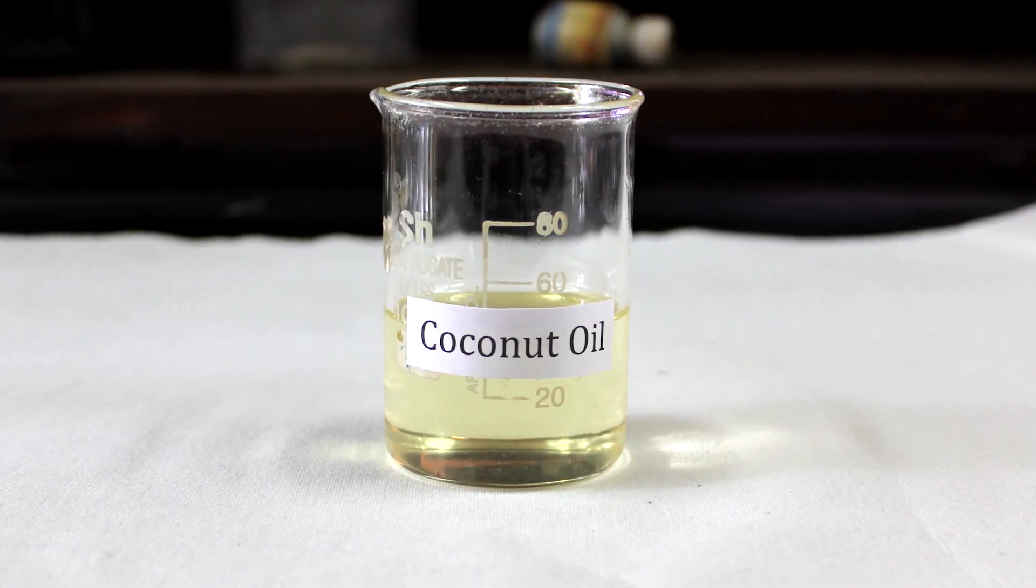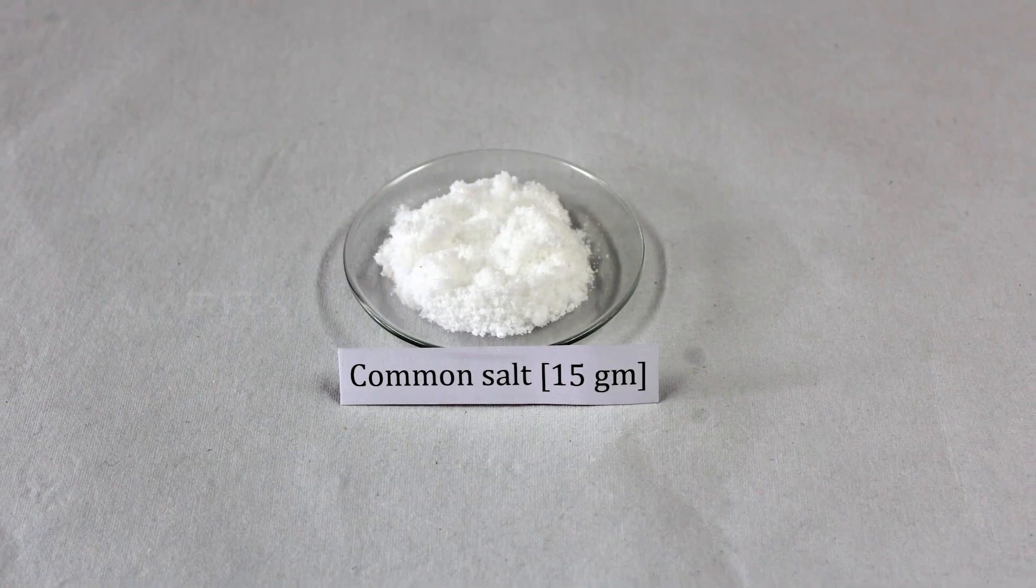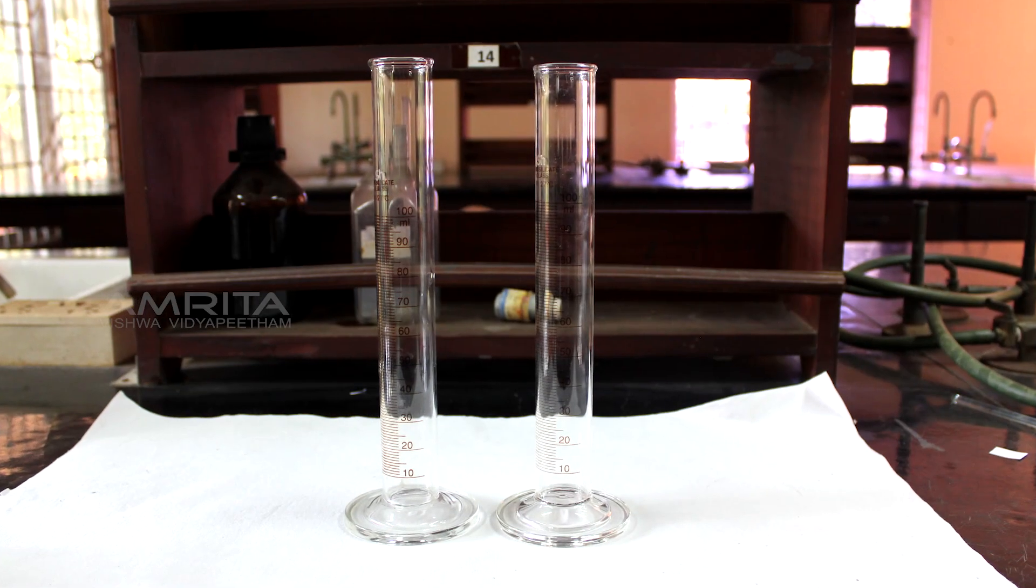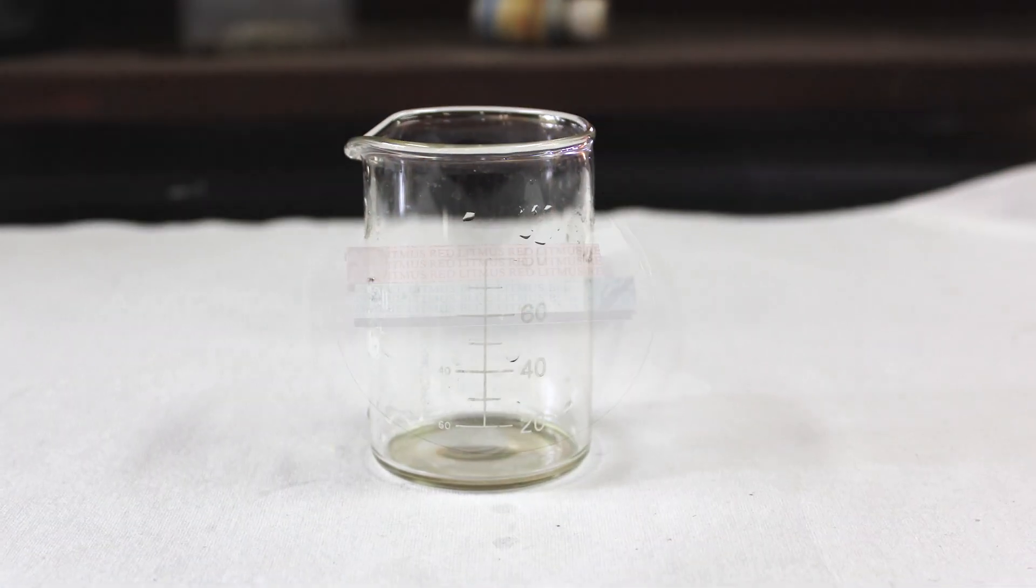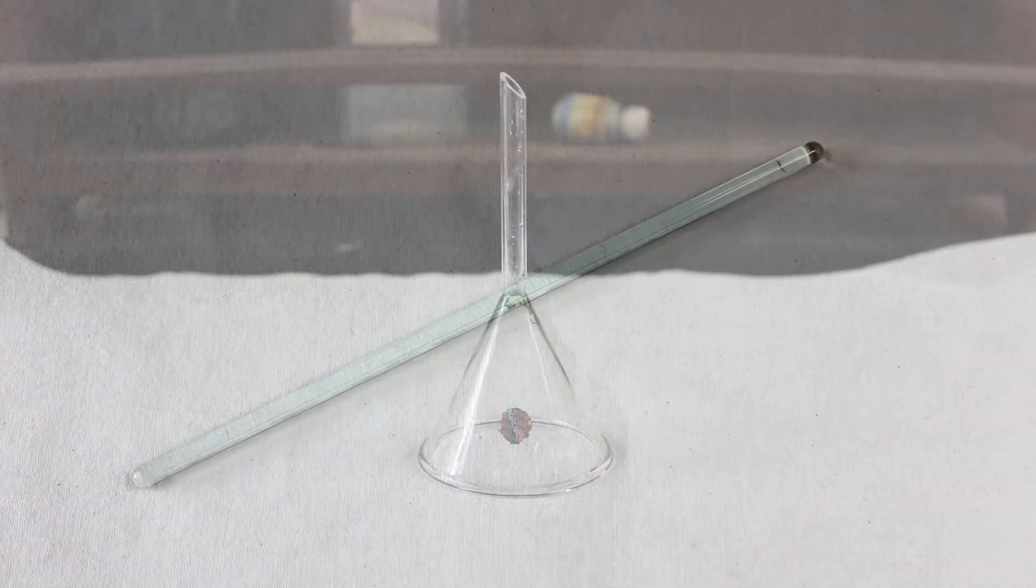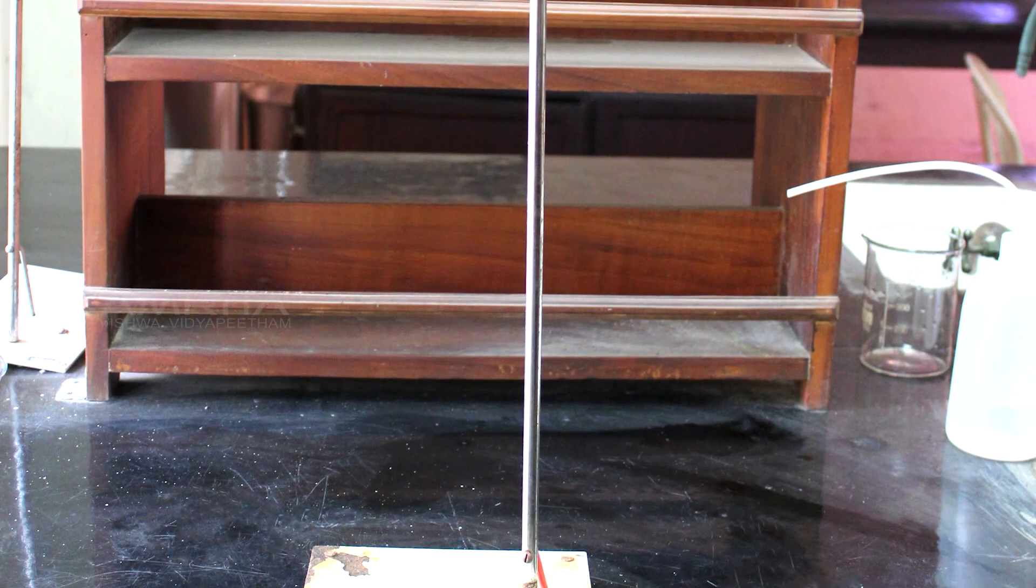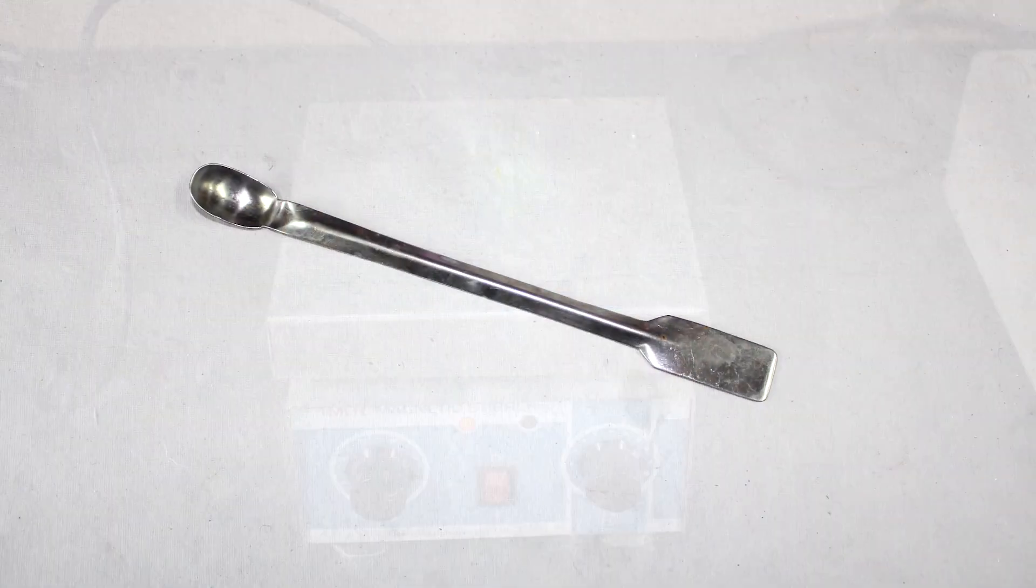Materials Required: Coconut oil, 20% sodium hydroxide solution, common salt, measuring cylinders, beakers, blue and red litmus papers, glass rods, filter funnel, filter paper, iron stand, hot plate and a spatula.